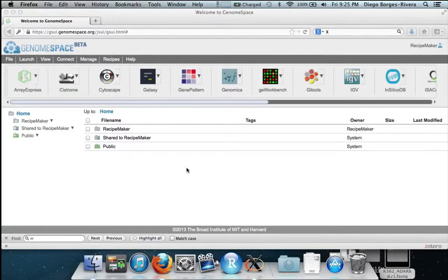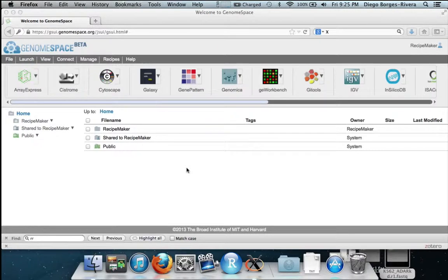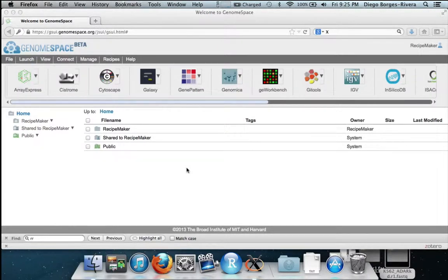This recipe details how to find subnetworks of interacting proteins that are differentially expressed in a control versus disease study using microarray expression data.